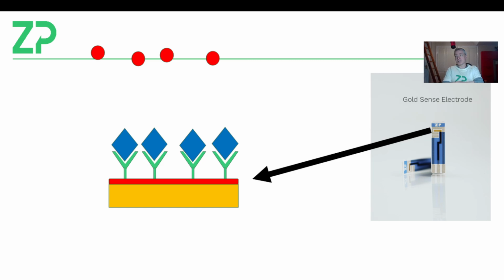But you could do this kind of chemistry by having just ferrocyanide, which is already in the reduced state. They scan to a positive potential, they oxidize the ferrocyanide to ferricyanide and they get their signal. If they added ferricyanide, it ends up at the negative potentials where they start, becoming ferrocyanide, and then they reoxidize it back to ferricyanide. So the source of their signal is, I think, a redox molecule, some form of ferrocyanide, that's trying to get to the electrode.